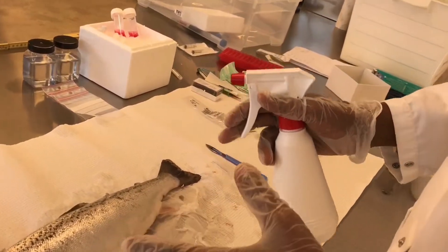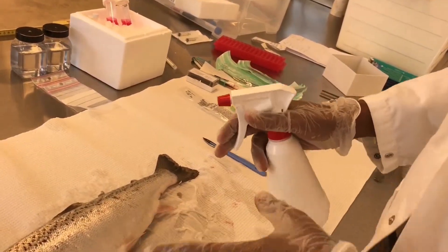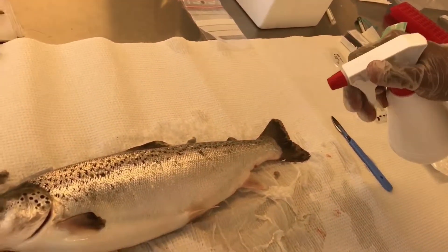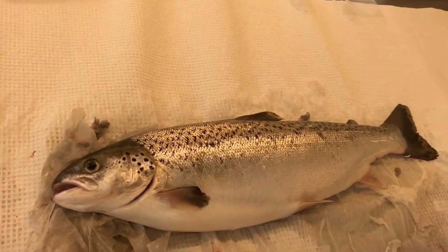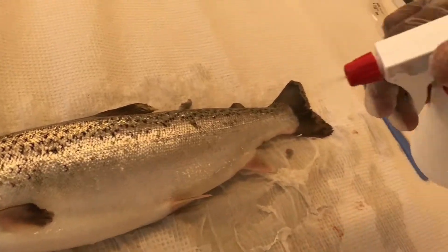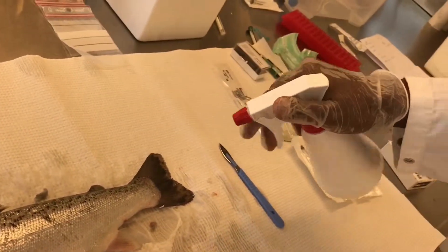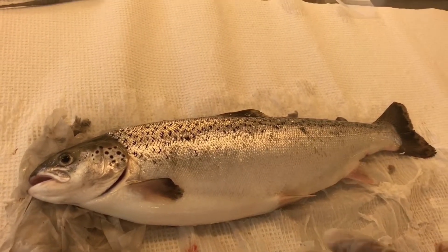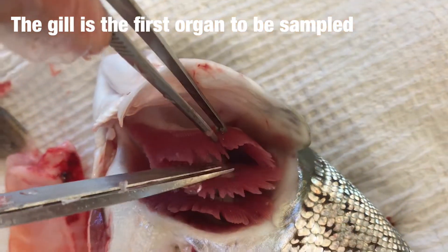Before we open the body cavities, we have to disinfect the fish externally in order to eliminate contamination from the external body. That can be done simply by spraying 70% ethanol on the surface on both sides.